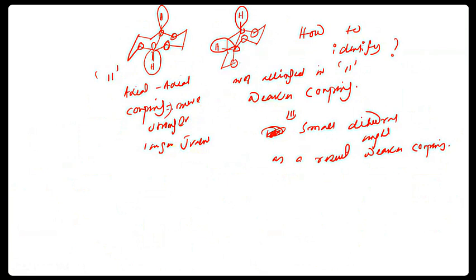Look, here the value is around 7 hertz and here it is very much lower. So orbital alignment matters a lot, as coupling works through bonds. Here J is equal to 1.3 hertz. So we can differentiate this kind of conformation also by coupling.